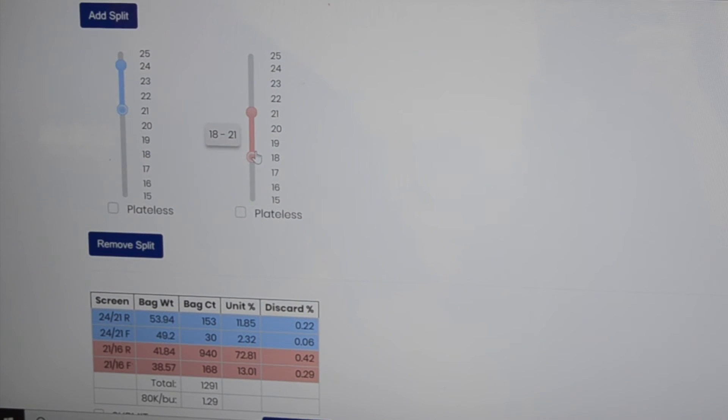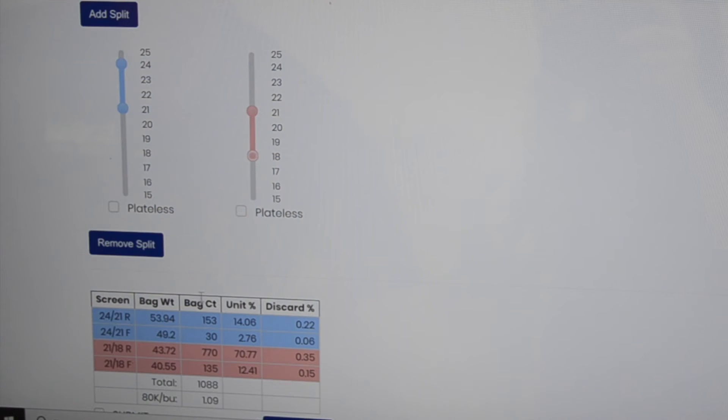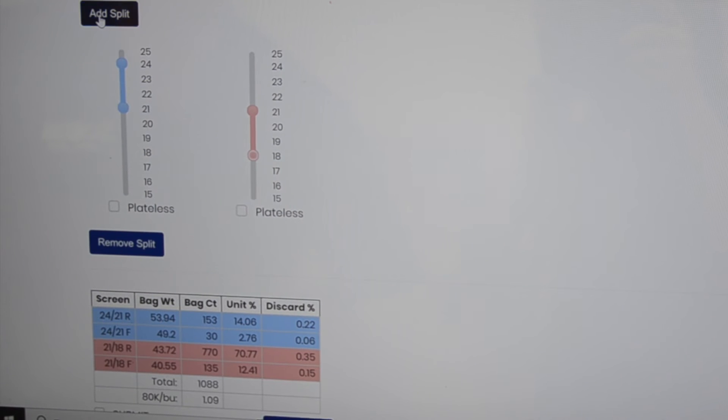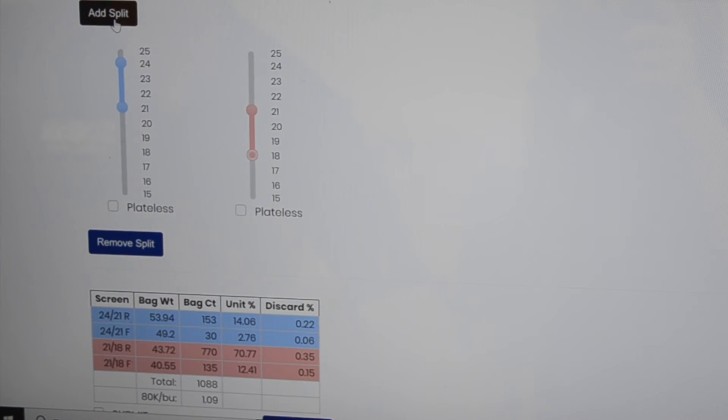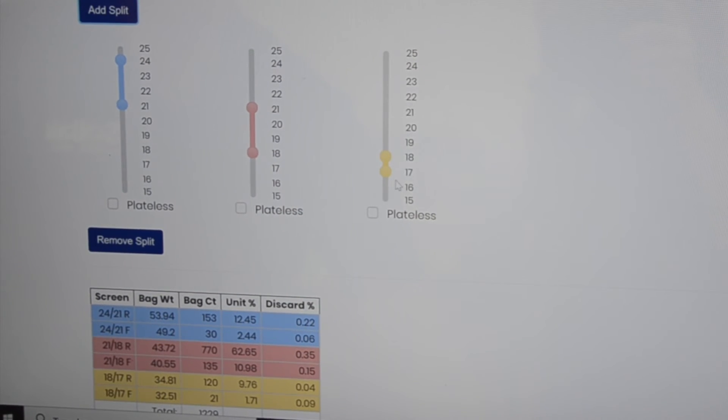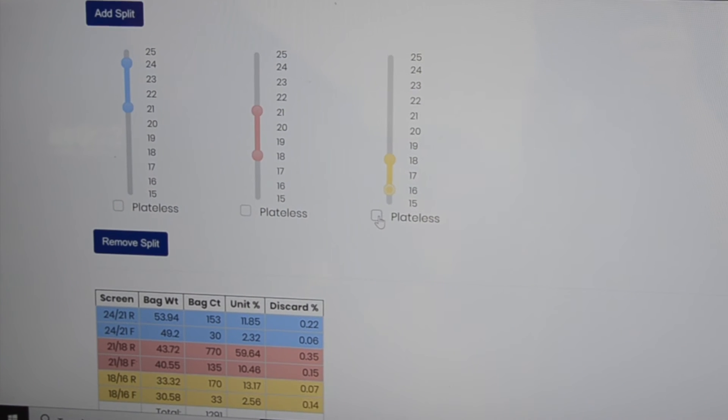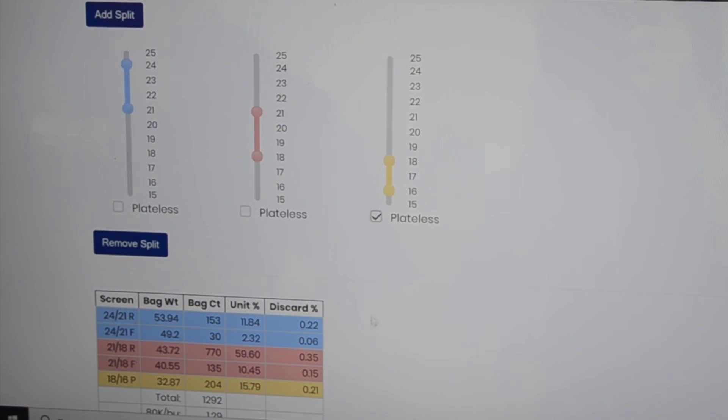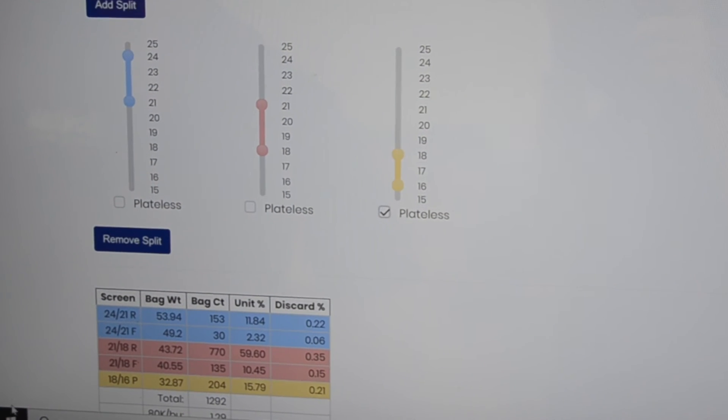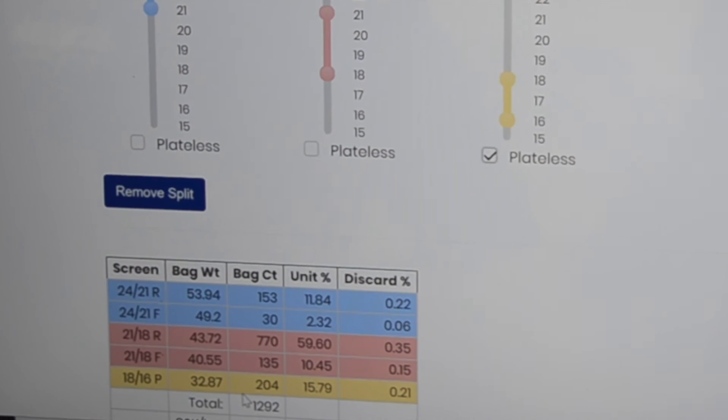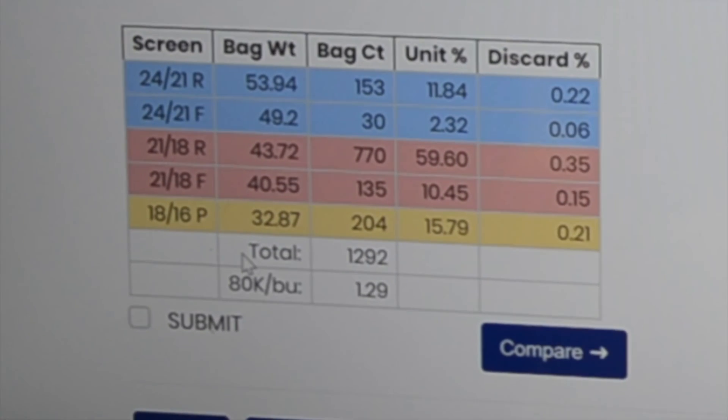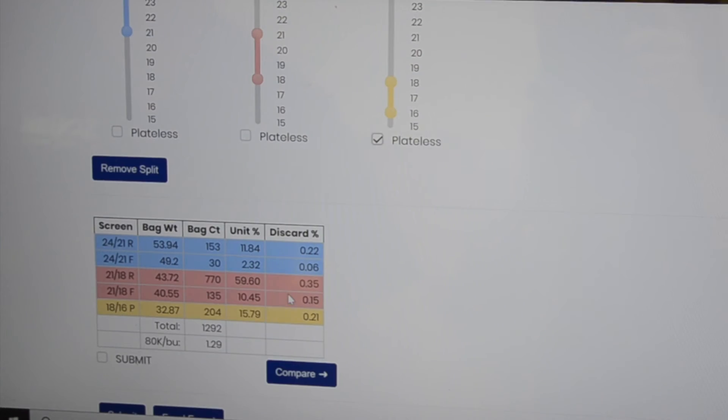Then add plateless after that and have an 18 16. You put in the plateless, and there you would get your combination of flats and rounds for the plateless.